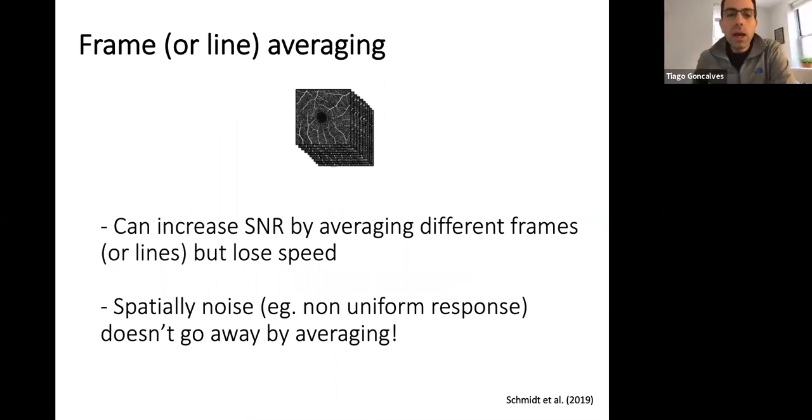You mentioned noise, and that's one of the things I wanted to talk about. One of the things you can do to reduce noise is to average different frames. Or sometimes if you're doing laser scanning with a PMT, this applies too. You can average different lines. You can run the same line 2-3 times over again. It's like making a measurement 3 times of the same thing, so you're basically increasing your N, and you average everything and reduce your noise.